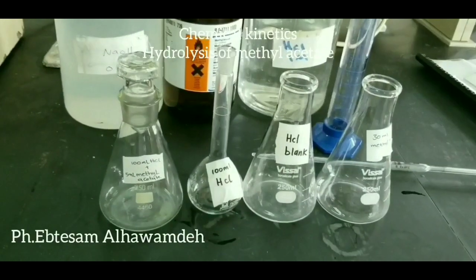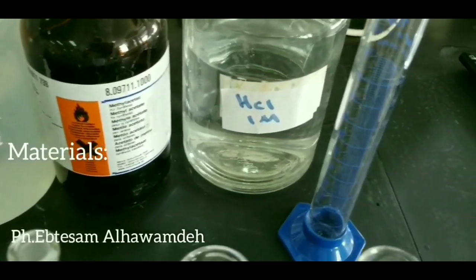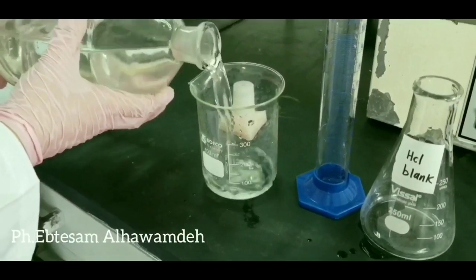Kinetic hydrolysis of methyl acetate. Our materials are HCl, volumetric flask, methyl acetate, and NaOH for titration.